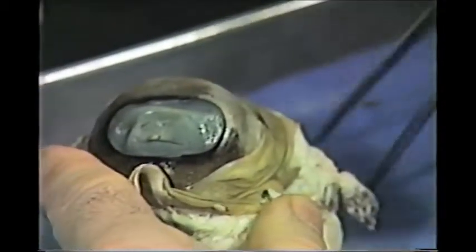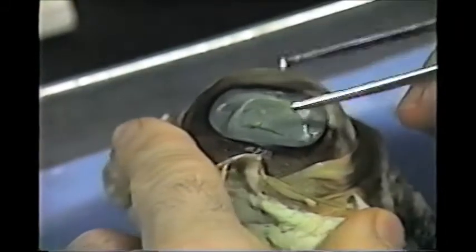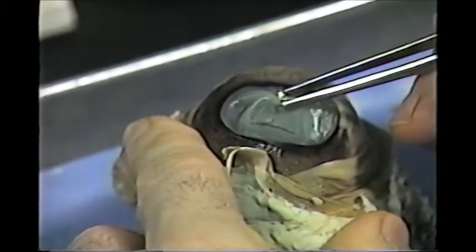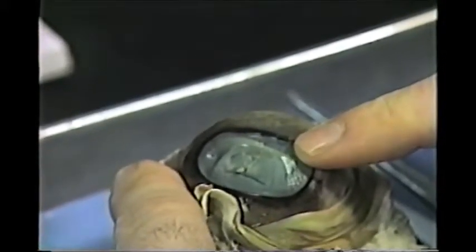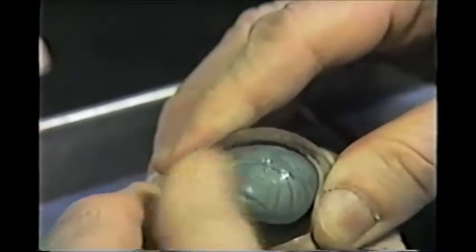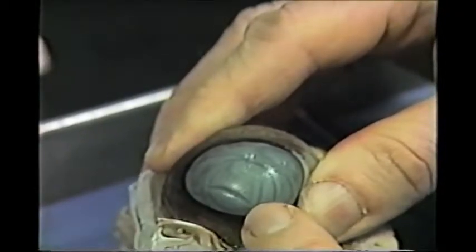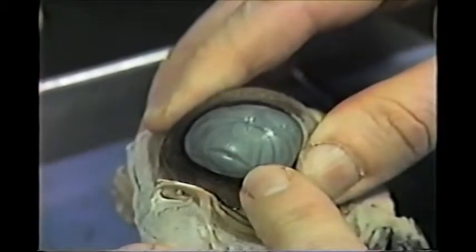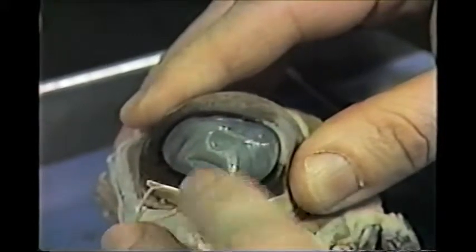If we look at the anterior or front of the eyeball, we see this shriveled up grayish structure. This is the cornea of the eye. Normally, this should be clear and puffed out, filled with a fluid called aqueous humor. The aqueous humor doesn't preserve very well and leaks out, so you get this collapsed, shriveled up cornea.